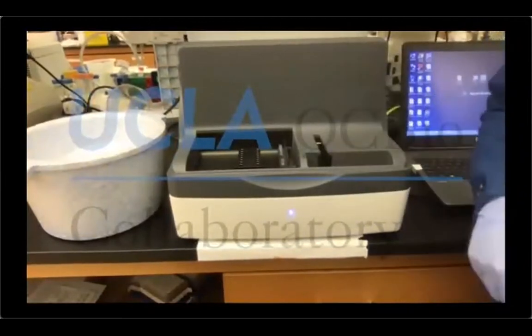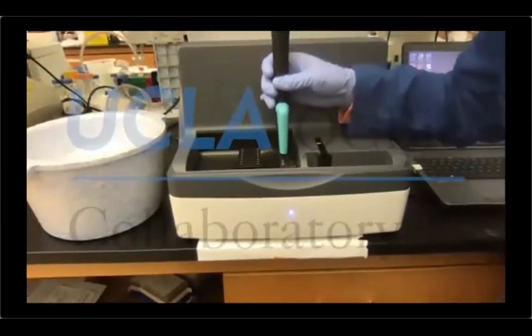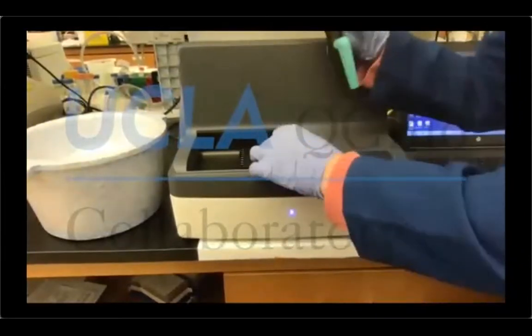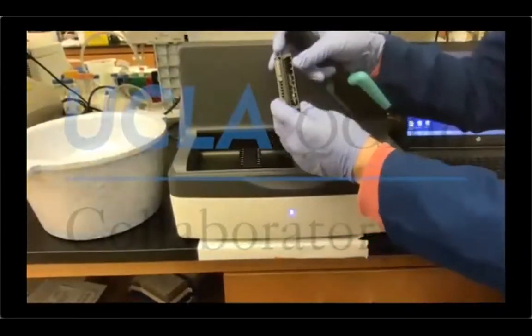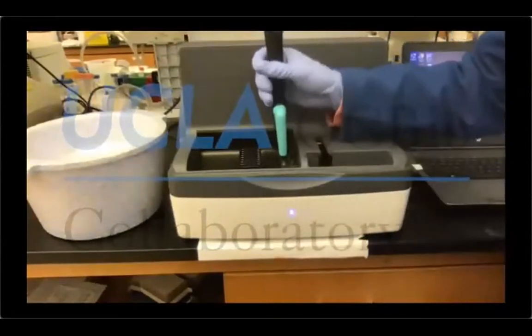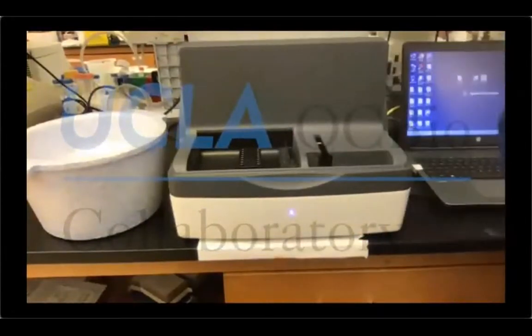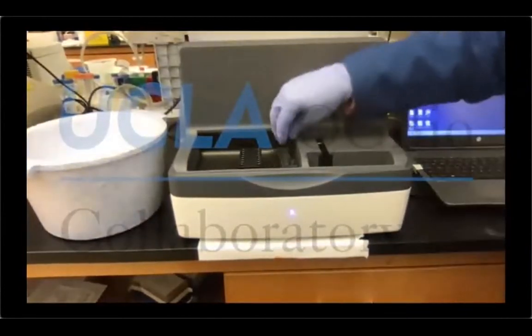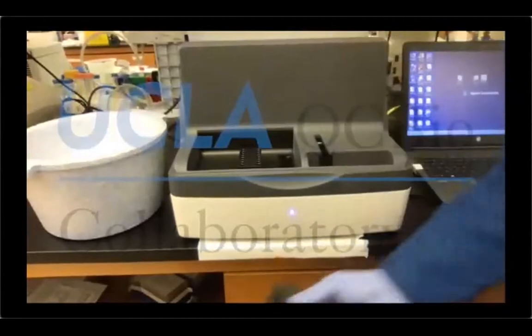The last part to clean up is actually the tips, okay? So I'm just going to collect my tips on the left, okay? The tips on the left are the ones that haven't been used. The tips on the right are the ones that have been discarded. So I'm just going to collect the tips on the left, and then I'm going to empty my bin, okay?